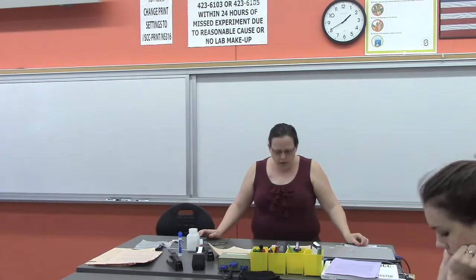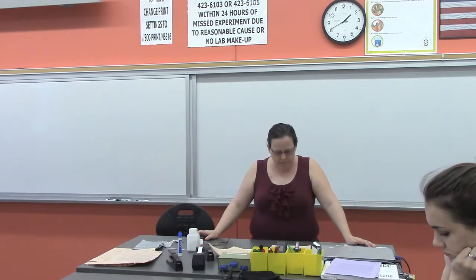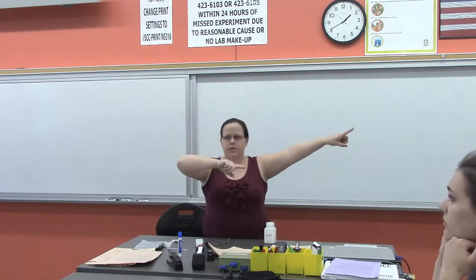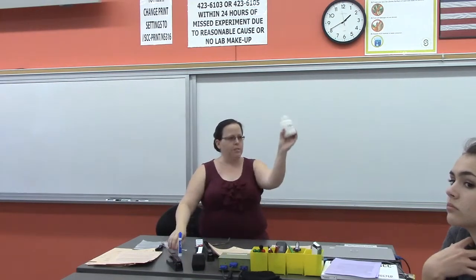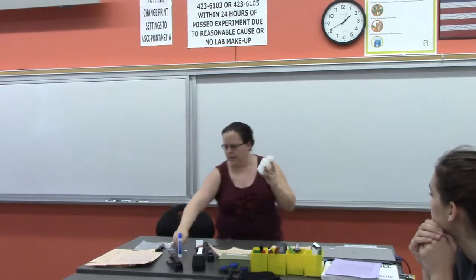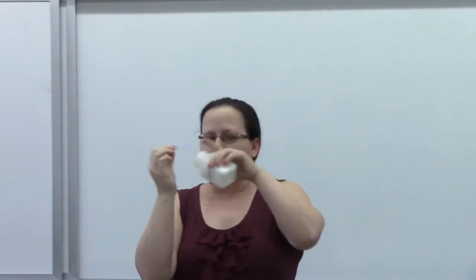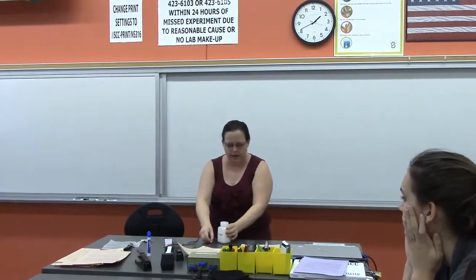So part A says, look at the samples of the substances water, table salt, table sugar, ethanol, wax, copper(II) sulfate pentahydrate, and mineral oil that are listed in the data table below. On each of the 3 counters, the side counter over here, the back counter, and the side counter under the window, you're going to see bottles where the bottle and the lid are both labeled with the chemical that's in them. There's also a little scoop, a little metal scoop, and on the scoop it has the name of the chemical. Before you do anything, make sure that all of those match, okay?